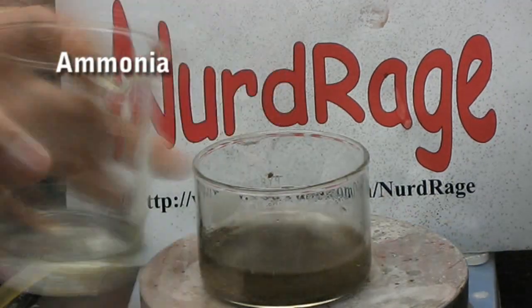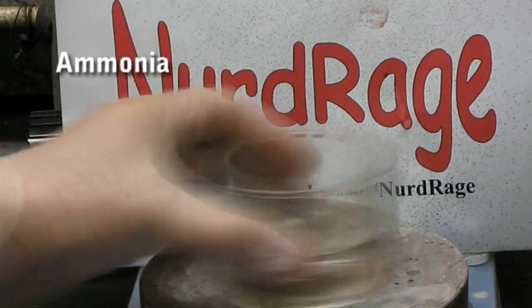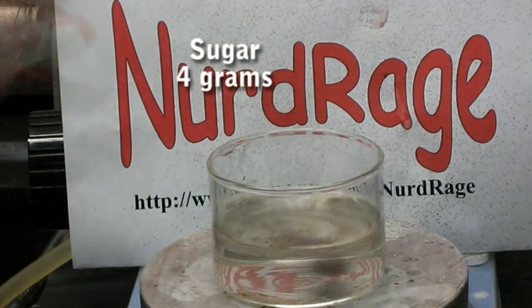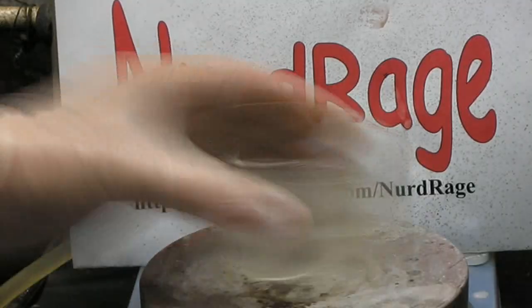Now with lots of stirring, add household ammonia to the mixture until you completely re-dissolve the silver oxide. When you have a clear solution, add in 4 grams of sugar and stir until it completely dissolves.